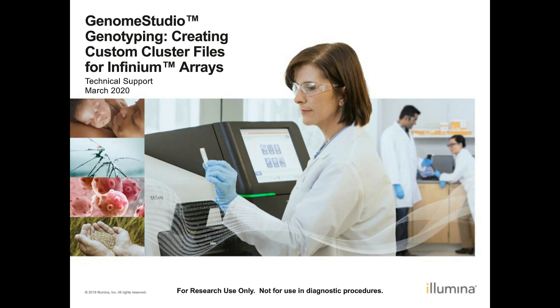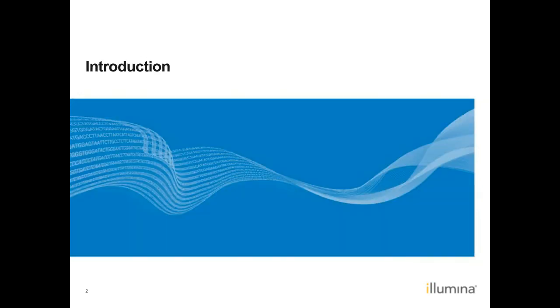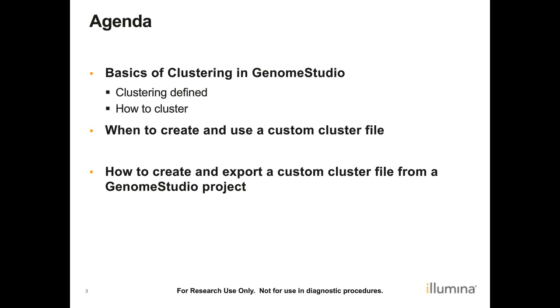Our goals for today: I'd like to go over with you the basics of clustering in GenomeStudio. What is clustering and how do you carry out clustering in GenomeStudio? We want to talk about when you want to create and use a custom cluster file, why you would want to use it, in what situations, and in what situations you would not. Also, we want to know how to create and export a custom cluster file from a GenomeStudio project. So these are our goals for today.